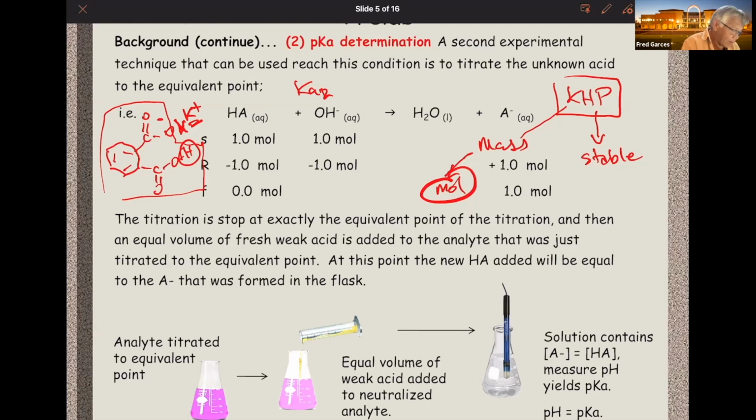Anyway, you guys don't have to worry about that, but I want you to be aware because you might have a question in the future about standardization. You guys are going to trust the concentration of the sodium hydroxide because I made sure that the concentration was correct in the data set, and then you can just look at the data when you watch the video.